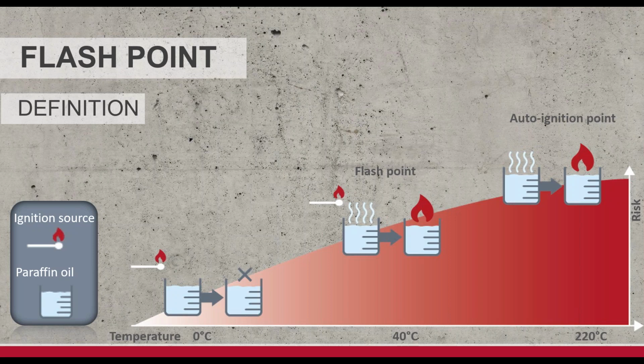So auto ignition point is very important because that's how fire resistance in cabinets and rooms and things like that is measured. They don't want the internal temperature to get to 220 C, a little over 400 F, and that becomes what is measured as flame resistance. Typically the integrity of a cabinet or a room doesn't get broken through by the fire itself. It's the heat from the outside that penetrates the walls and gets to the inside, getting a temperature to reach its auto ignition point.